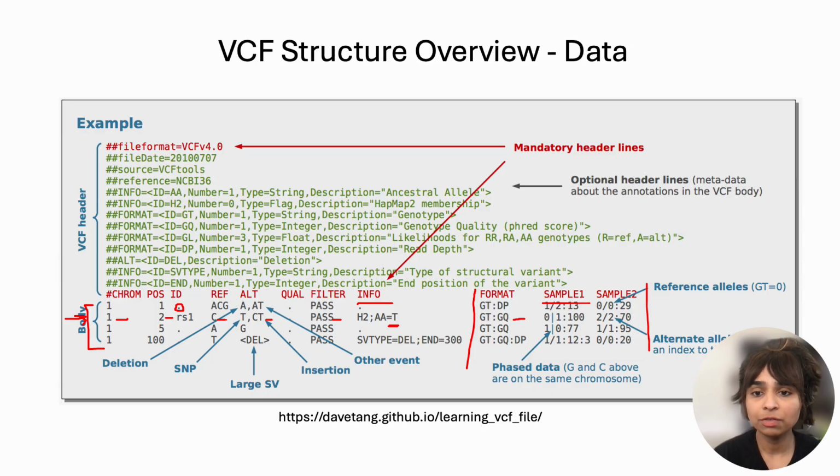The number after this is 100, right? And that is the quality score, showing that this call is very reliable. Now let's go to the next example, that is sample 2. And here we see 2/2 colon 70.